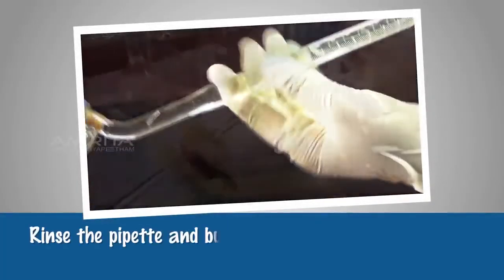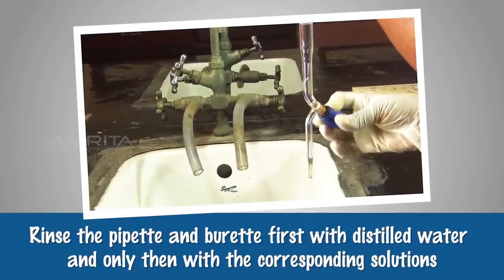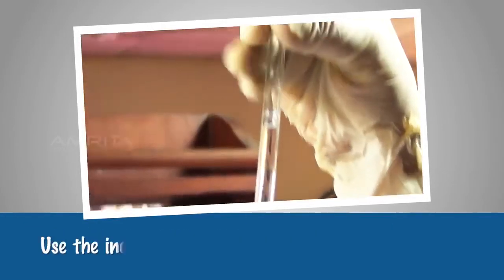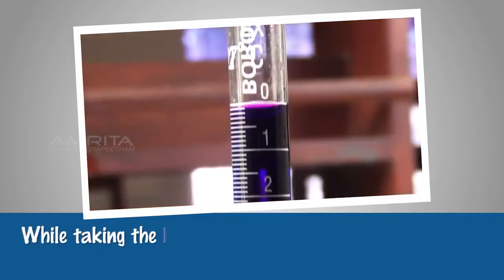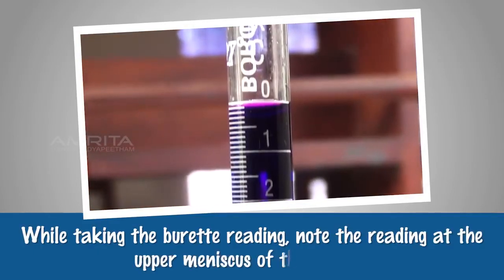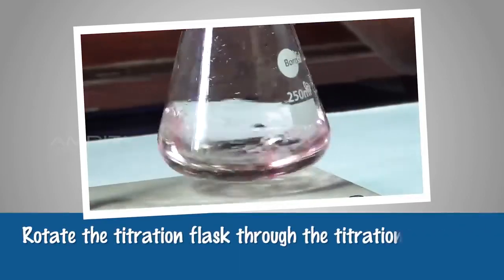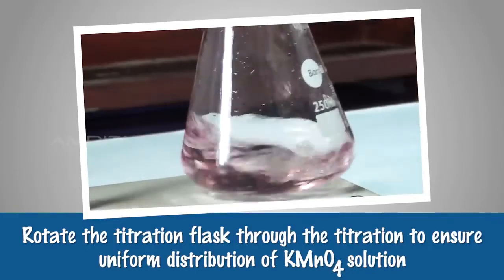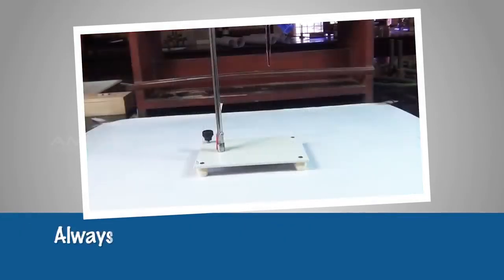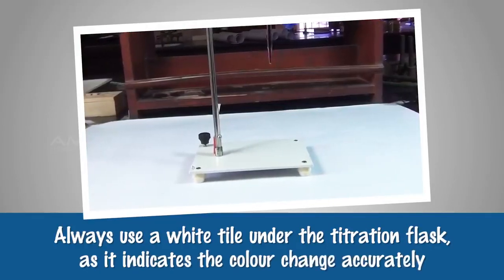Precautions. Rinse the pipette and burette first with distilled water and only then with the corresponding solutions. Use the index finger to close the mouth of the pipette. While taking the burette reading, note the reading at the upper meniscus of the solution. Rotate the titration flask throughout the titration to ensure uniform distribution of KMnO4 solution. Always use a white tile under the titration flask as it indicates the color change accurately.